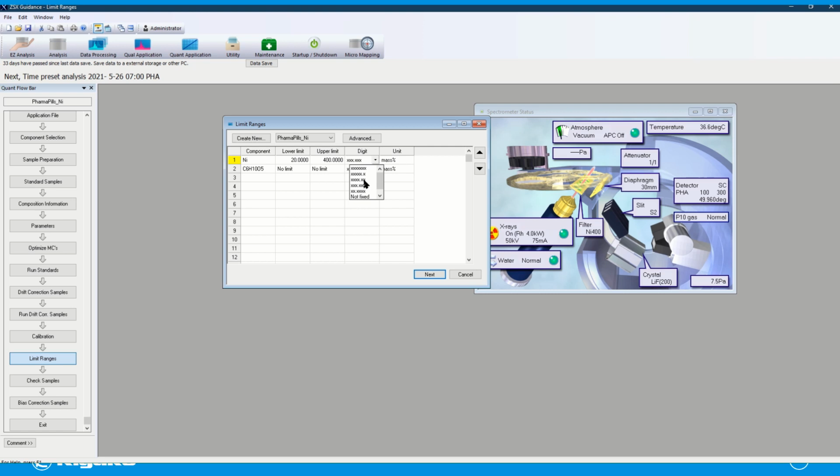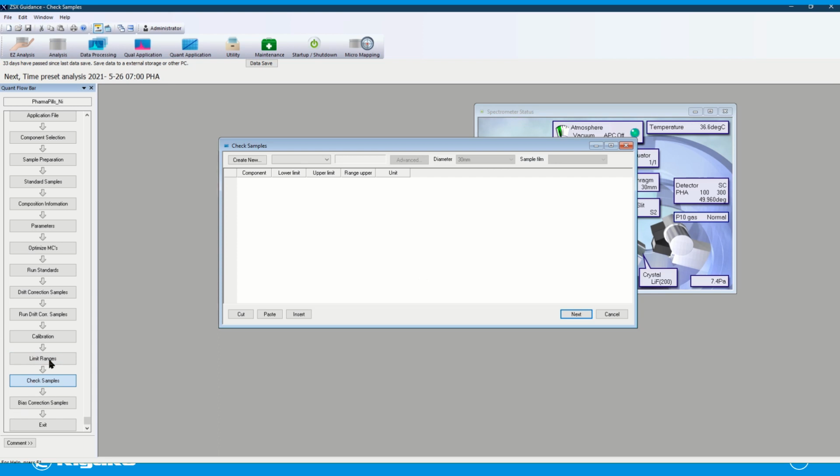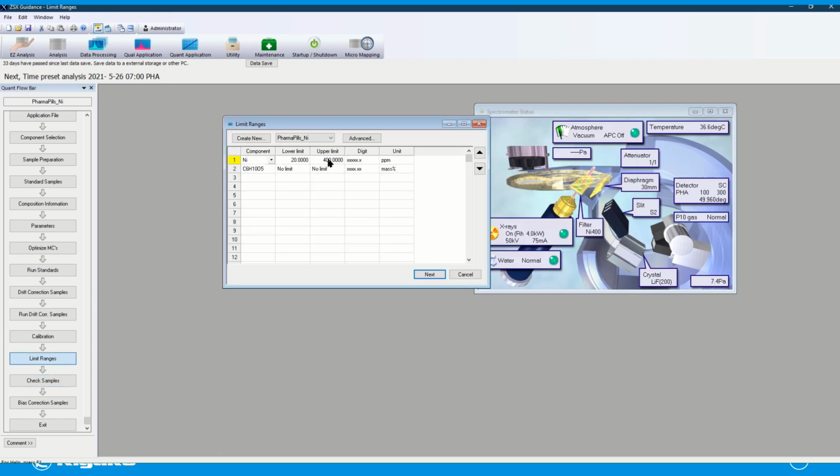Obviously, we're doing it down to ppm. Maybe we're going to just do 1 digit or 2 digits for that. And then of course cellulose, we would say that's, let's say, 2 digits. That's just a balance. And then our unit, we want to make sure it's reporting a result out as ppm. That would be for setting a limit range within the confines of what our calibration curve is.